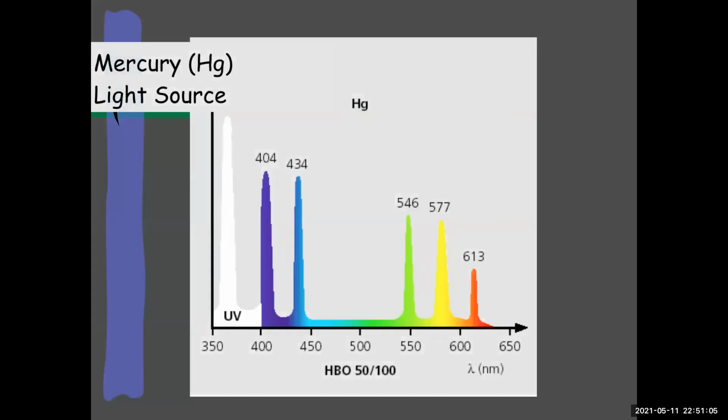But here's arc lamps. Also, we tend to think of the arc lamp as just giving us white light, but in truth, they have their own spectrum and their own pattern too, and they're better at certain colors than others. And so this explains a lot. If you go from one scope to another, you're like, it's brighter on this one, but I have the same filter set. How come it's brighter? Well, maybe your arc lamp is different.